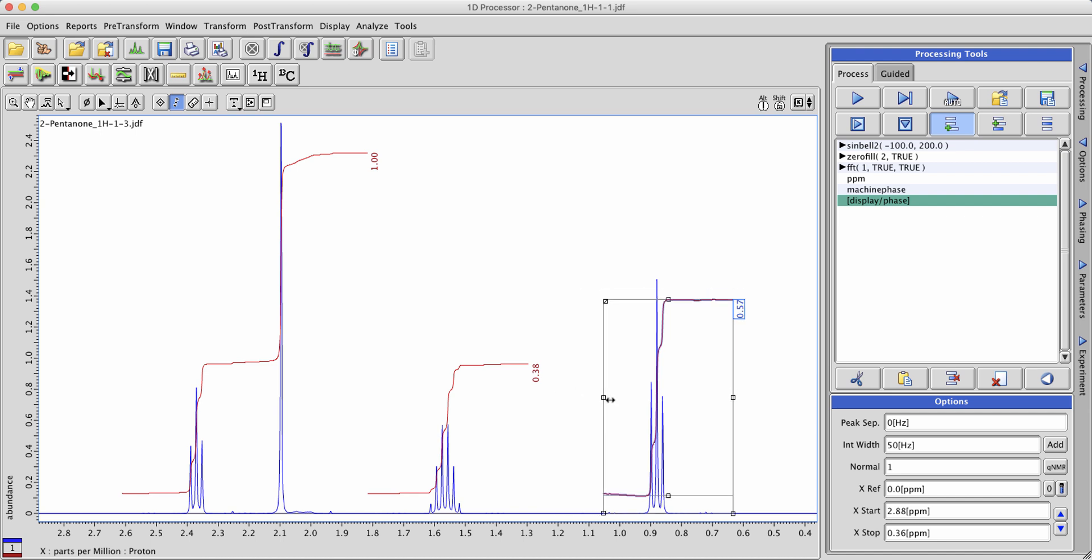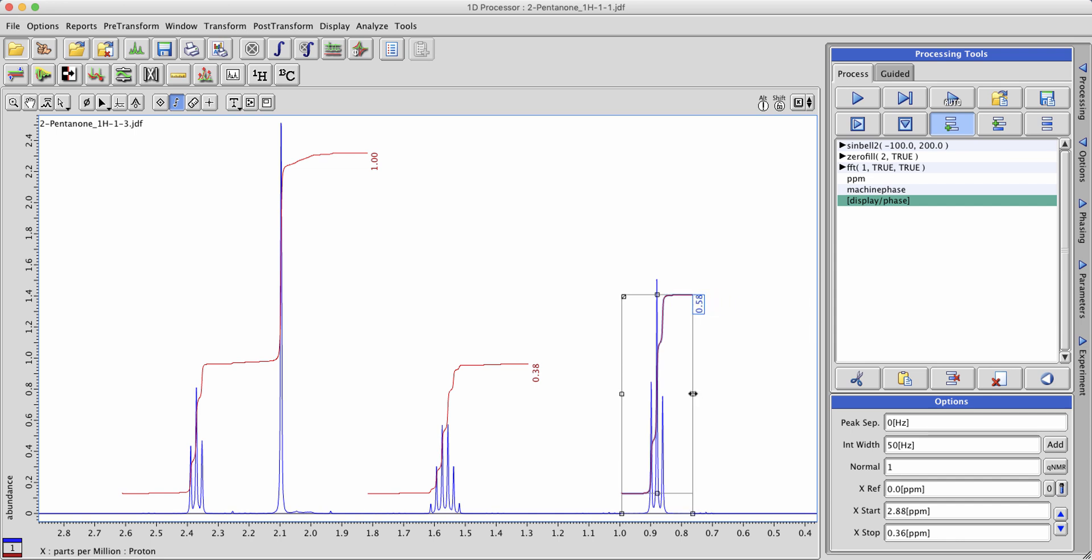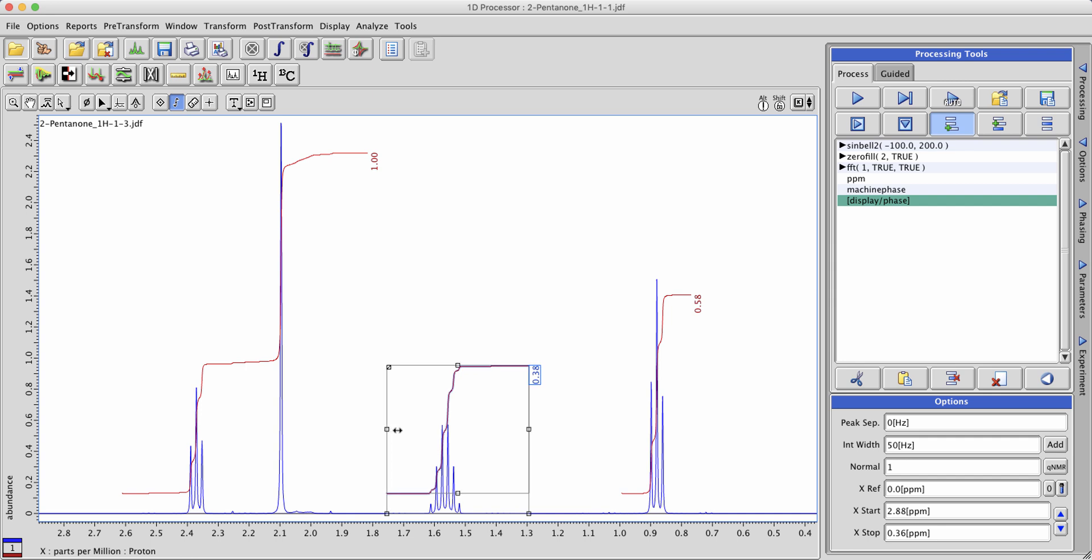You can reset the bounds by left-clicking, holding, and dragging on these little boxes here. We'll do the same thing with this integral as well.